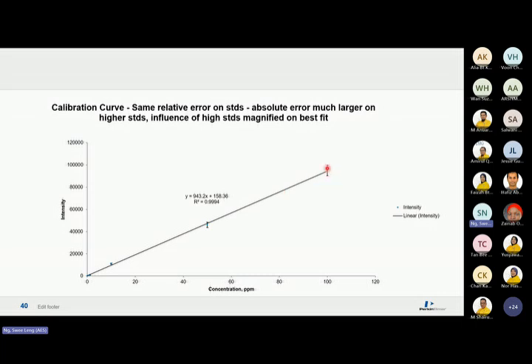the relative error. So let's say 1% error in the 100 ppm, or 1% error in the 50 ppm. They are different. 1% error in the 100 ppm is 1 ppm. So if I have a 1% error in 100 ppm, anything at the bottom level, a 1 ppm result, is all gone. Because if I move it up, this one will go down. So as long as I have a movement of 1% error in this area, my 1 ppm result will be gone.